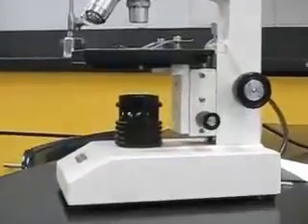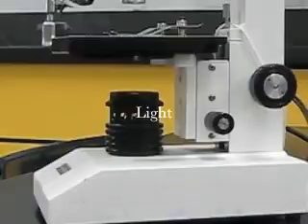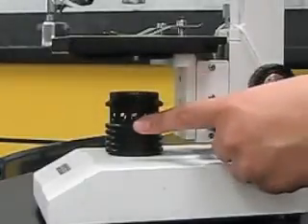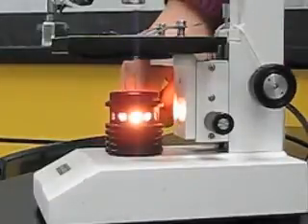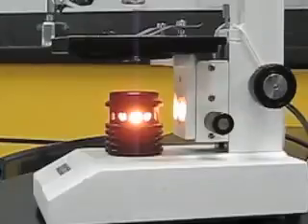In order to use your microscope properly, you need an adequate light source. The light source is found at the bottom of the microscope, and on and off switches can be a roll bar or a flip switch found to the right, left, underneath the stage, or in front of the stage.